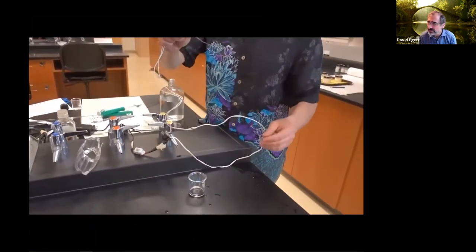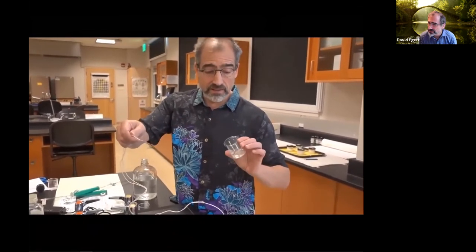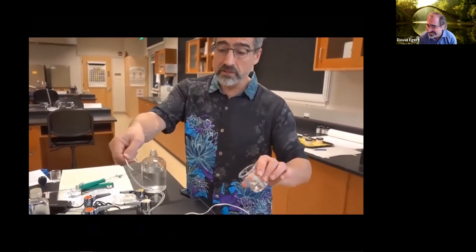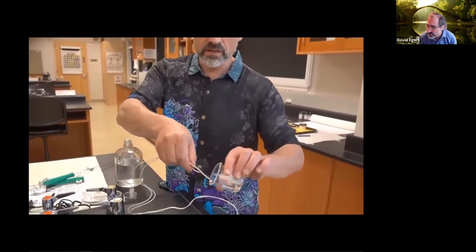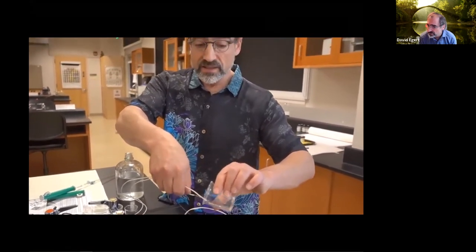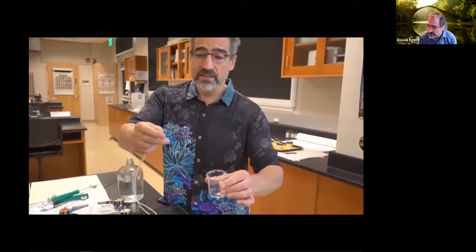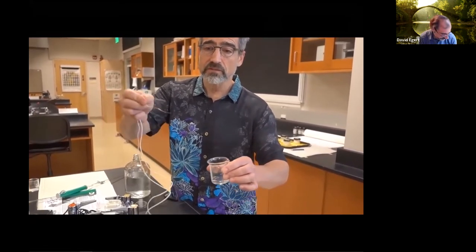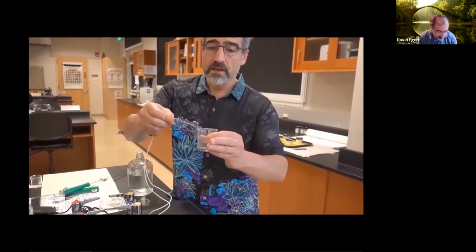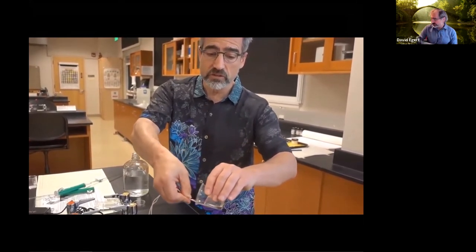Then we can look for the continuity. We put the wires in. They don't make a current in the air, but if they are submerged in the potassium chloride, I can hear a buzz. So again, I want to hold them in parallel so they're not touching, and make sure there's a large surface area submerged, and sure enough.